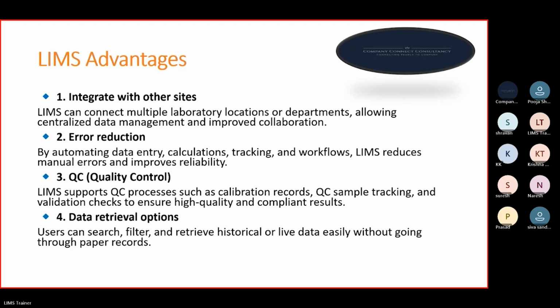They will choose the global LIMS. Okay, so LIMS will be implemented at their representative site, and after that all the sites will follow that system. Okay, so master data also will be global in that scenario.